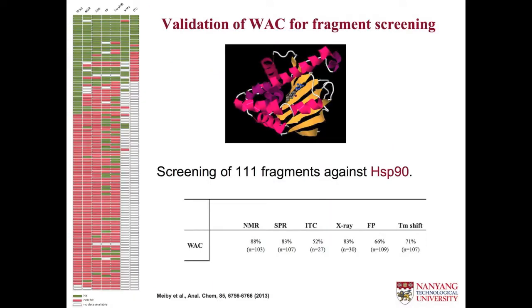And Eleanor made, about 5 years ago now, a validation study together with the company in Cambridge, where we screened towards the chaperone HSP90, screening 111 fragments and validating towards other technologies they were using at the company.